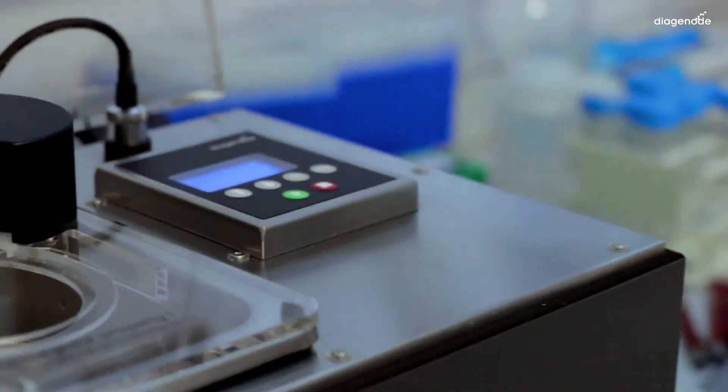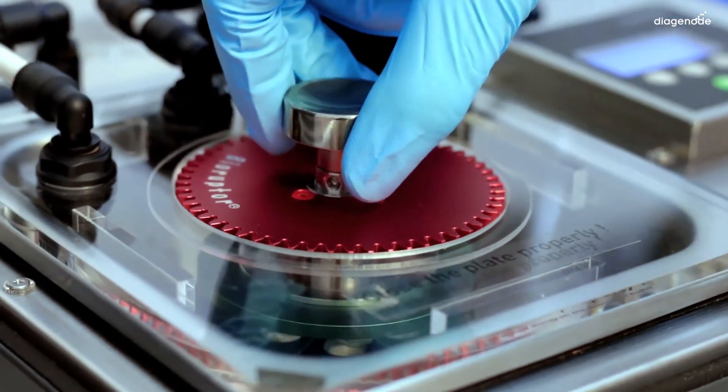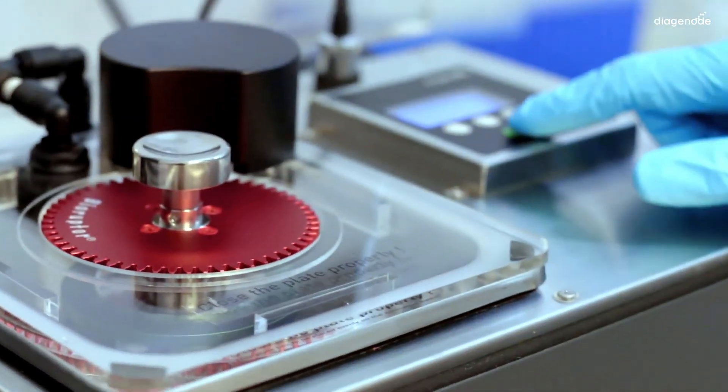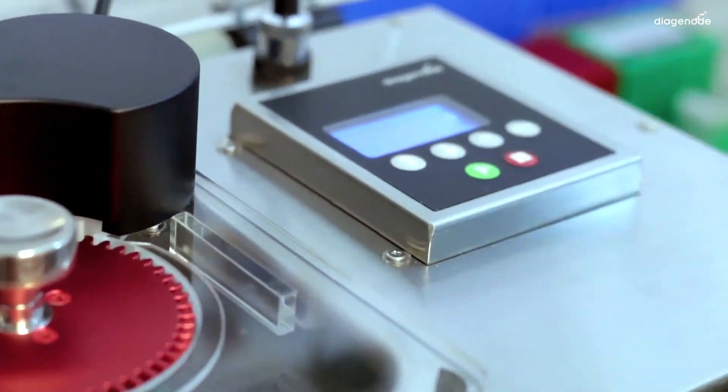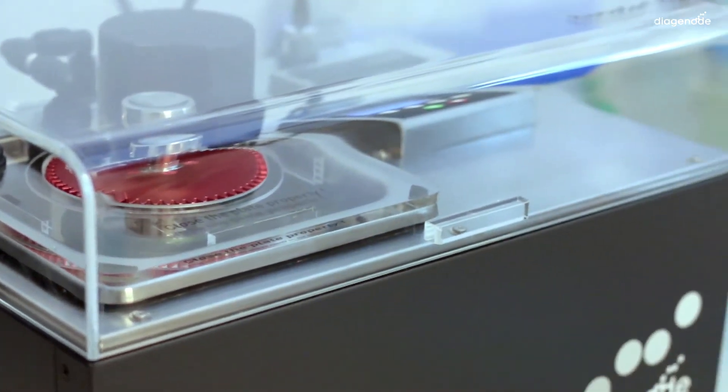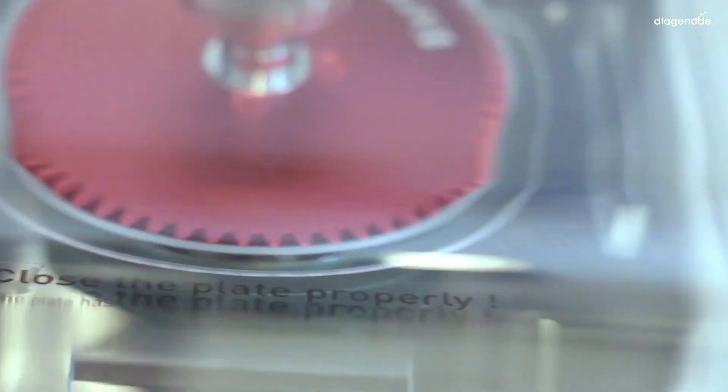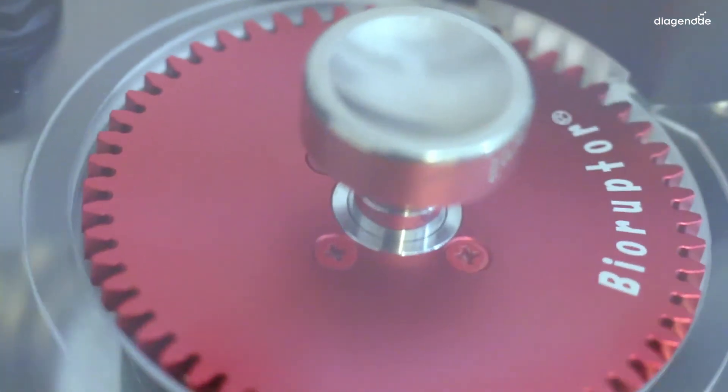Just put a tube holder full of tubes into the sonication bath. Push the start button and close the lid. If you hear the sound, it means everything is OK.